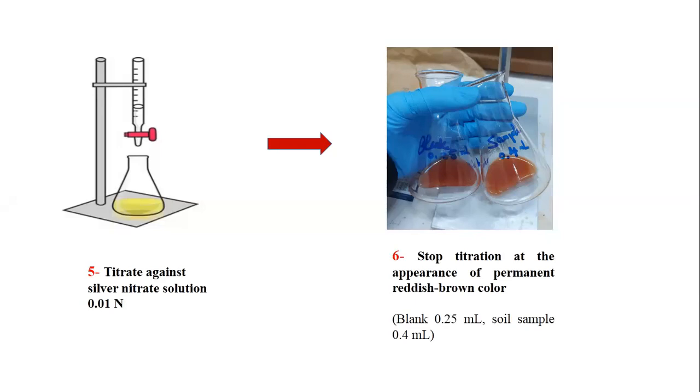Normally with titration with chloride, the color starts from the beginning, but it will not change completely to red. So when you are doing titration, it is important to think that it is not like the others.